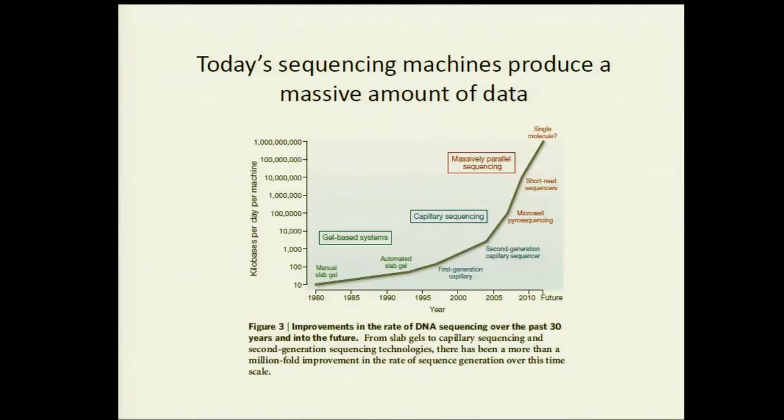And what we want to explain with this slide is that as the decades move on, the sequencing machines get better and better, and they produce more and more output. So not only do you have to be accurate, but your tools that process NGS data have to be really, really fast and efficient. At this point, we're dealing with terabytes of data for lots of projects. And I don't mean 1 terabyte. We're talking about hundreds of terabytes of data for particular projects. If the GATK can't process this data, it'll just fall apart, and you won't be able to actually run your project. So it's a lot of work not just to get accurate tools, but tools that run on all this data.